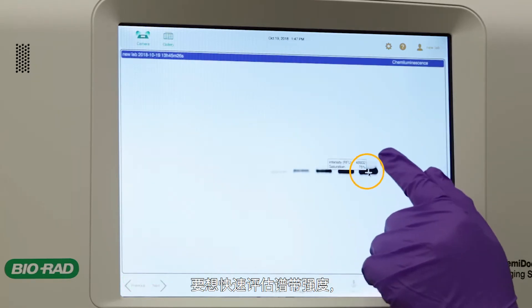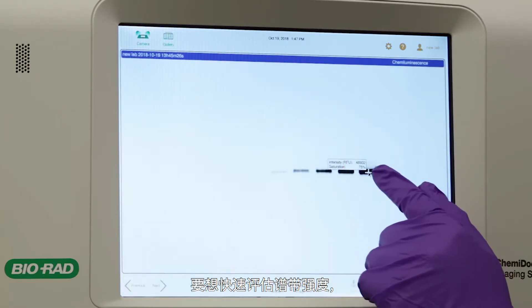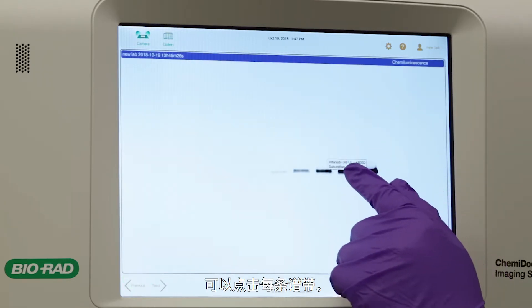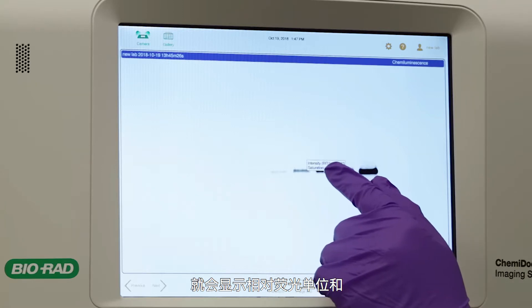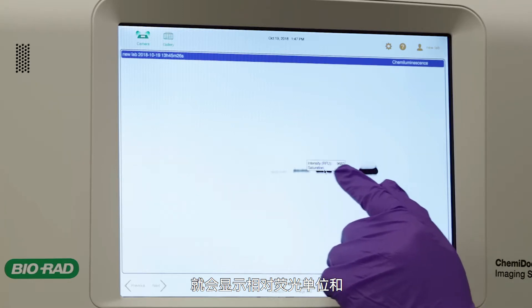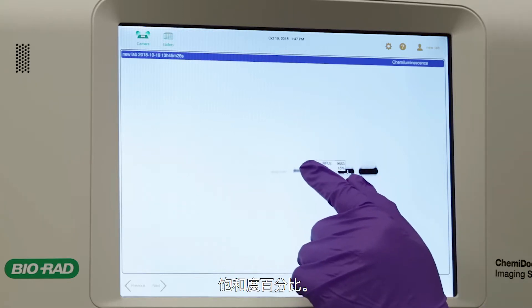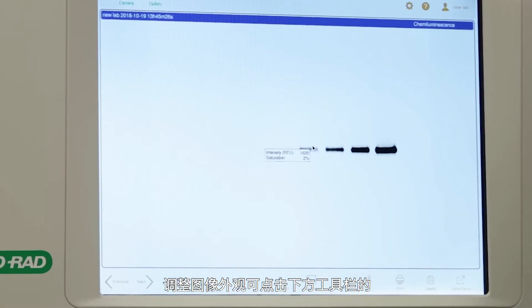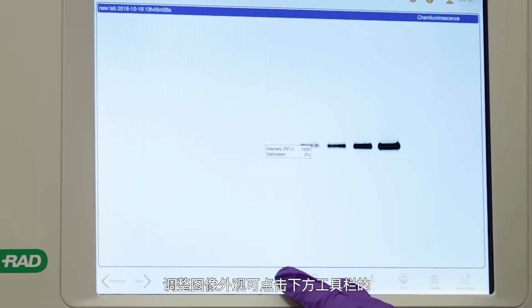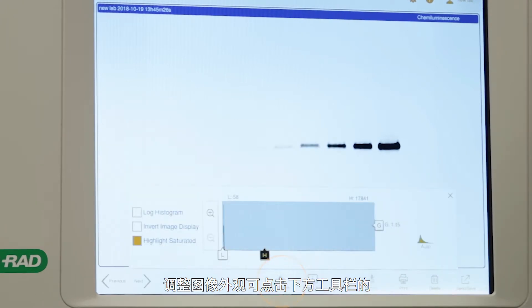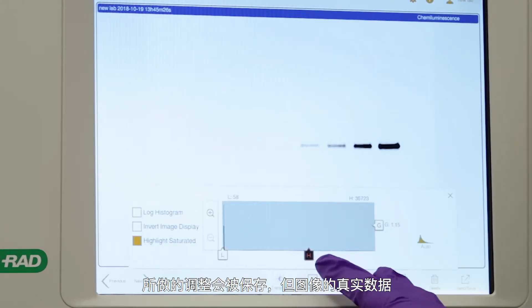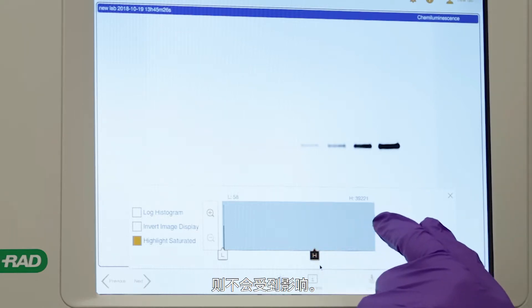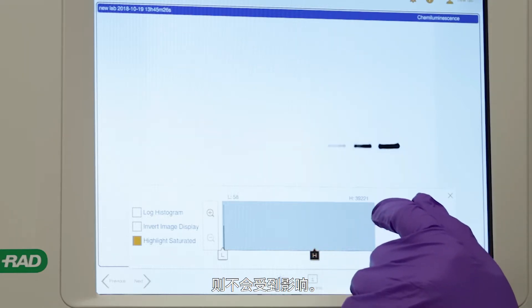For a quick assessment of the band intensities, you can tap each band — the relative fluorescence units and percent to saturation will appear. To adjust image appearance, tap the Transform icon in the lower toolbar. The adjustments will be saved, but the actual data will remain unaffected.